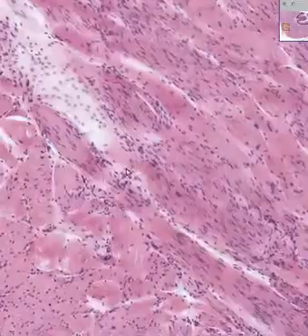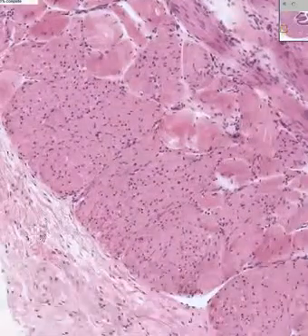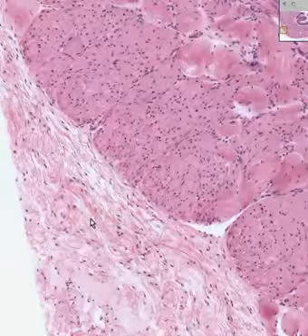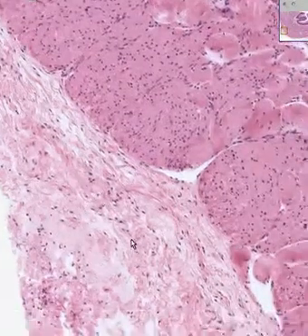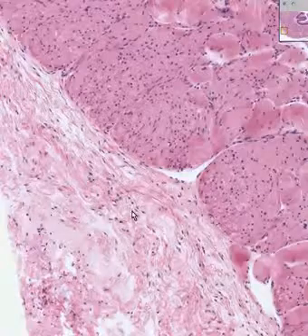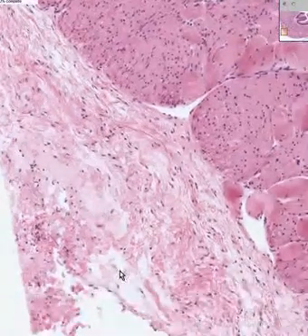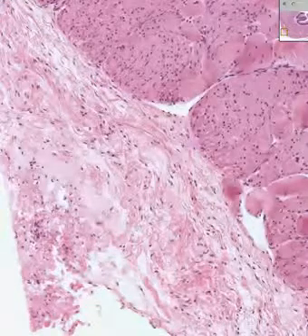And then once again, here we are out at the connective tissue of the adventitia, loose collagen bundles, relatively loose irregular connective tissue, chiefly fibroblasts. There's a little blood vessel there, maybe some fat, and we're totally finished with the esophagus.